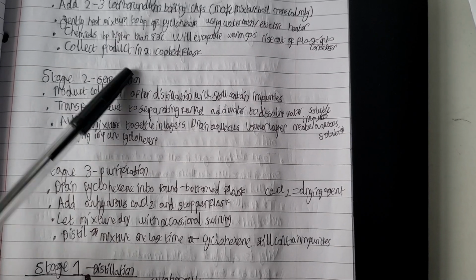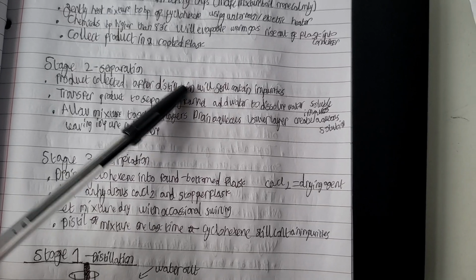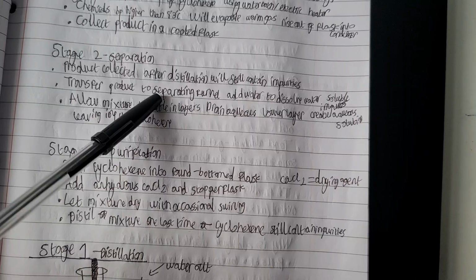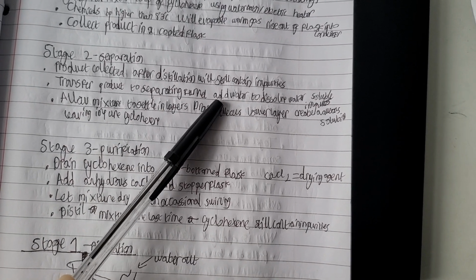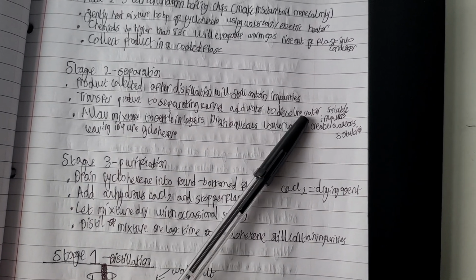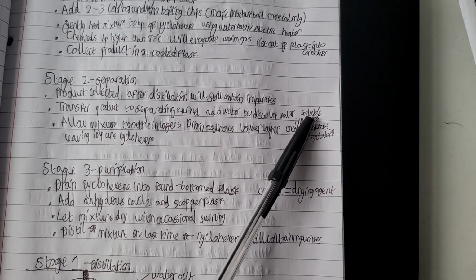Stage 2, separation. Now we've got the product in the cool flask. However, the product collected after distillation will still contain impurities. So we're going to transfer the product to a separating funnel. And once we transfer the product to the separating funnel, we're going to add water to dissolve water soluble impurities. So we're going to get rid of some impurities, water soluble impurities.